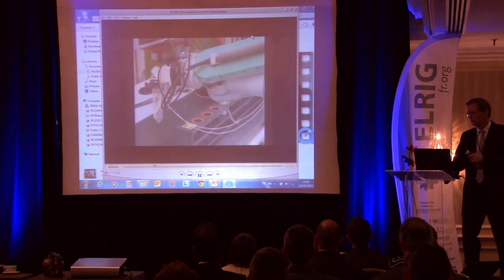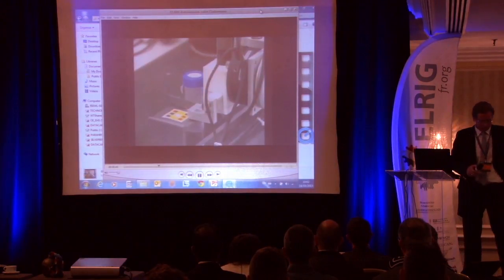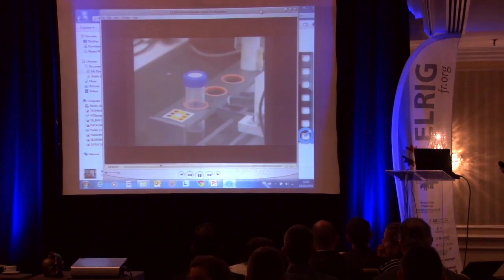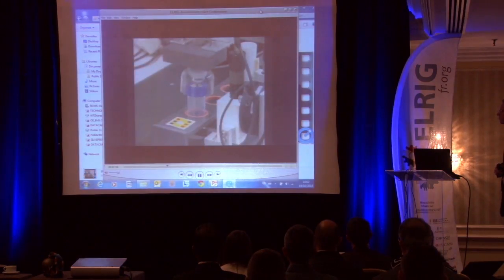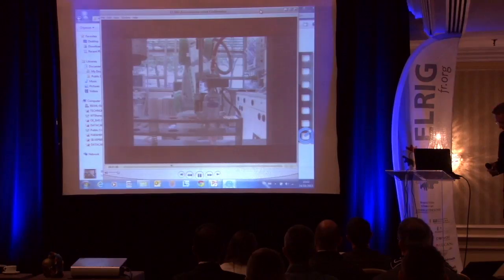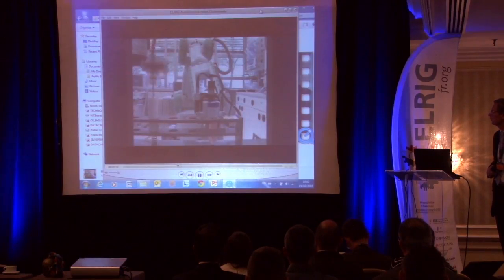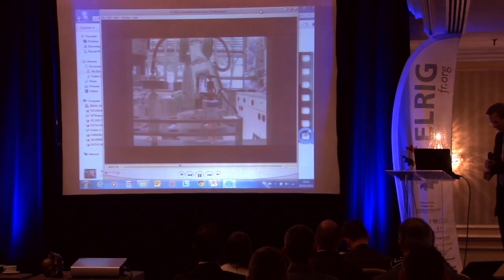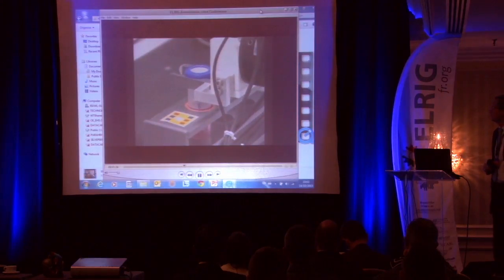The vial, which is covered with a septum, is put into the holding rack of the sampling device. The sampling station is connected to the bioreactor via an aseptic pneumatic sampling valve, which is inserted into a standard adapter in the bioreactor jacket. Two more pneumatic valves control the culture broth flow. After discarding the first part of the fluid, the rest of the sample is taken aseptically and aerosol-free. The septum seals the vial tightly after sampling. The tubes are flushed with condensate and are steam sterilized after taking the sample. The sampling device is then prepared for the next cycle.